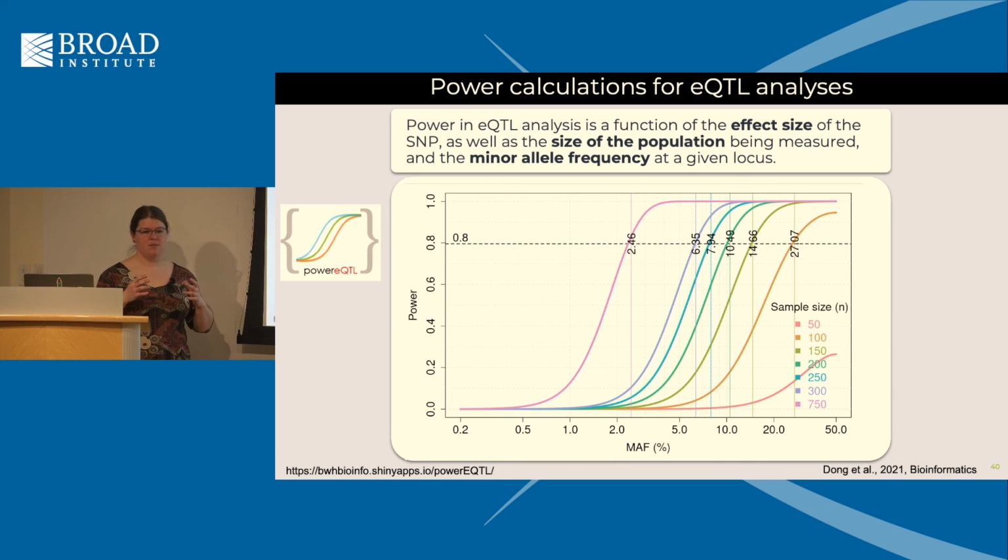And that allows you to compensate for dropout, or this genotype chip doesn't look very good, or this person's genome didn't sequence very well. There's going to be a little bit of data dropout pretty much no matter what. And so 100 people is the minimum by and large. And I think the more people you have, the more sensitivity, the more power you're going to have to actually pick up eQTLs that have smaller and smaller effect sizes with smaller and smaller minor allele frequencies.